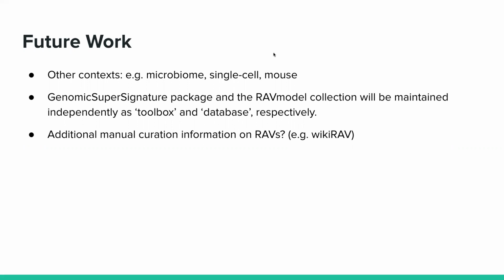Yeah, the good news there is when it comes to the technical parts, at least in RNA-seq, what we saw was very good insensitivity to those methods. Whether we put the RNA-seq through a variance stabilizing transformation from limma or some packages that do this, or just did a log2 of counts plus 1, they produced very similar results.